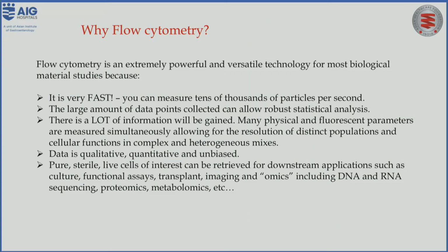So why flow cytometry? It is an extremely powerful and versatile technology for most biological applications because it is very fast. You can measure tens of thousands of particle events per second, and a large amount of data can be generated, which allows robust statistical analysis.